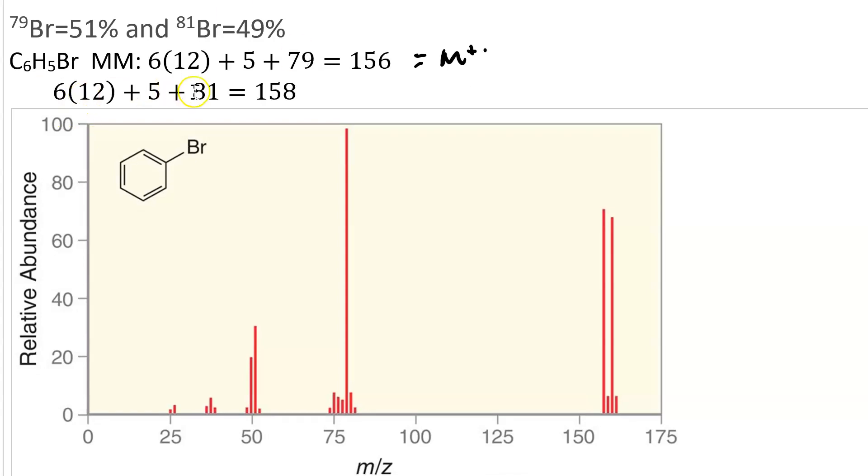And if we calculate the molar mass with a bromine-81 instead of a bromine-79, we get 158, and that is our M plus 2 peak. And their heights should be nearly equal, and indeed that's what we see. Here we've got 156 and 158.